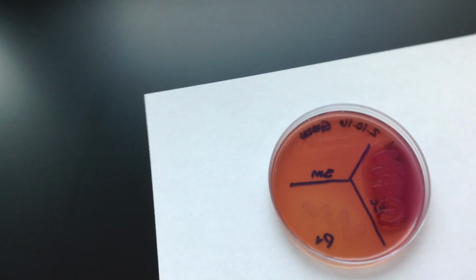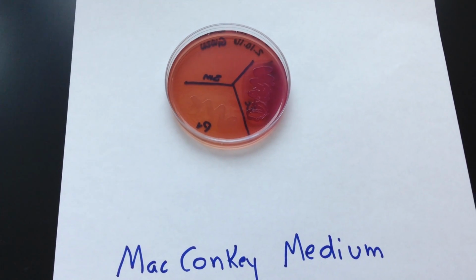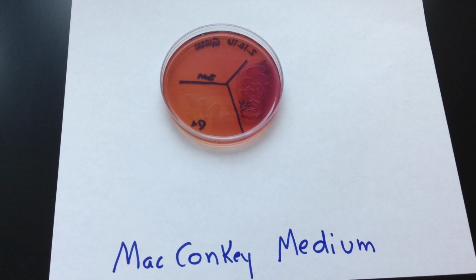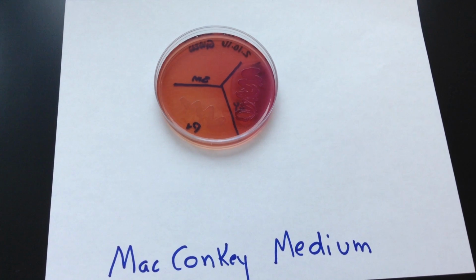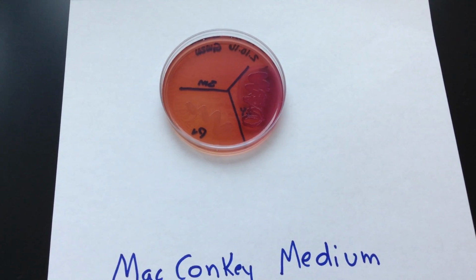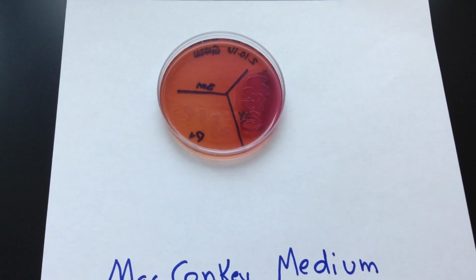Okay, so in review, again, MacConkey's is a selective and differential medium. It is selective because of the ingredients crystal violet and bile salts, which prevent gram-positive bacteria from growing on the medium. And so we can say that it selects against gram-positive bacteria, or we can also think of it as it selects for gram-negatives, allowing them to grow. So we also said that this is differential as well. And so because there is a sugar in there, lactose, we can look to see if the organism can ferment or break down that sugar with the enzyme lactase.